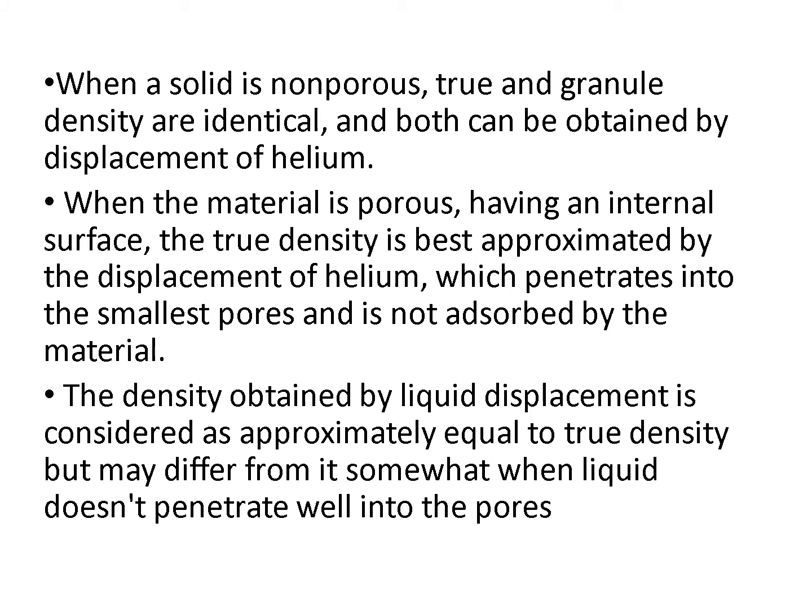At the same time, the same amount or a different amount of helium will enter the empty gas chamber, and the pressure is measured and converted into volume according to the ideal gas law, PV equals nRT. And this experiment is done at room temperature, constant temperature.